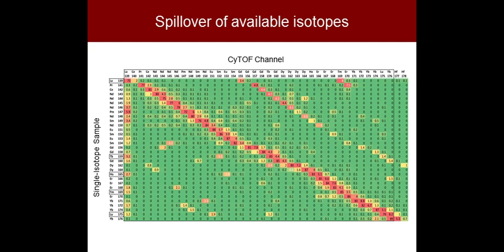And then there's yet a third observation here, which if you look off to the right, there's a second streak diagonally that mirrors the primary channel. And it's reddest, it's most noticeable at the lower atomic masses. And that is what we call oxidation.